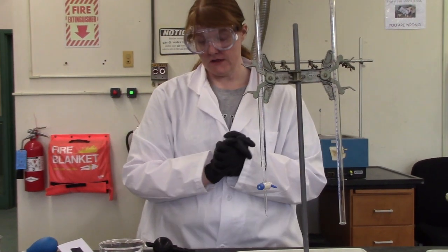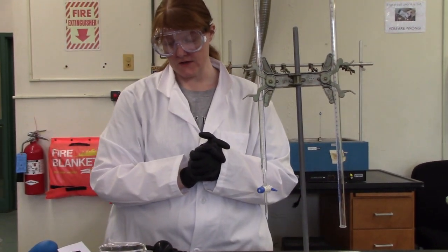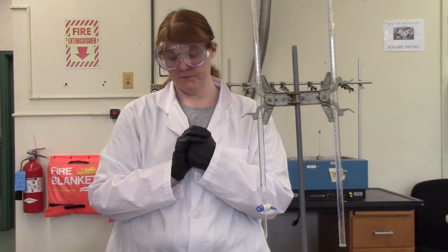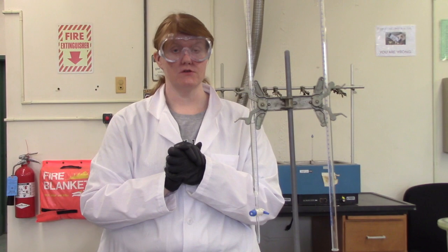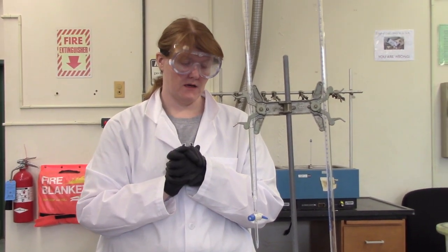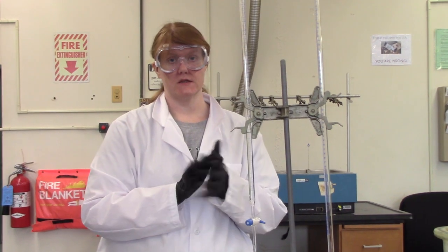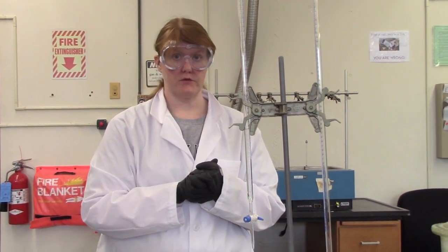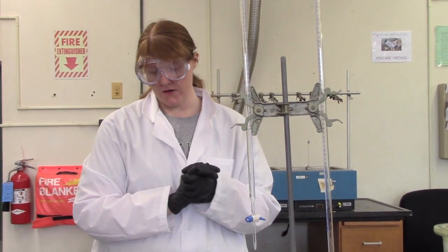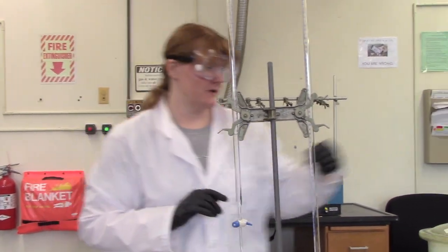So you're going to keep doing this with your NaOH and your oxalic acid until you have three results within 0.5 milliliters of each other, okay? If it takes you more than like four, five maybe titrations, you should talk to your professor. Maybe even more than four, I would say, because it means there's something in the technique that's not working out and you need to diagnose the issue before you spend the whole lab period doing that, okay? Because the next part is to determine the concentration of an unknown acid.